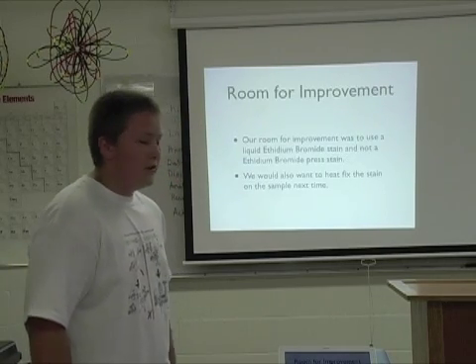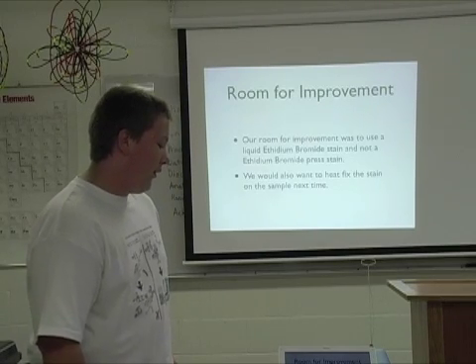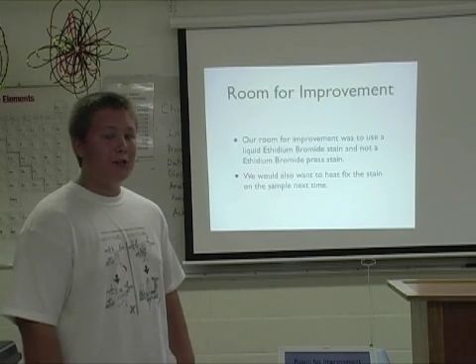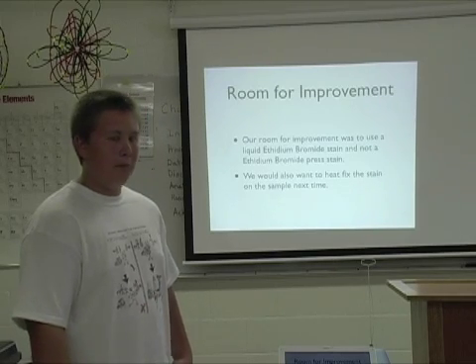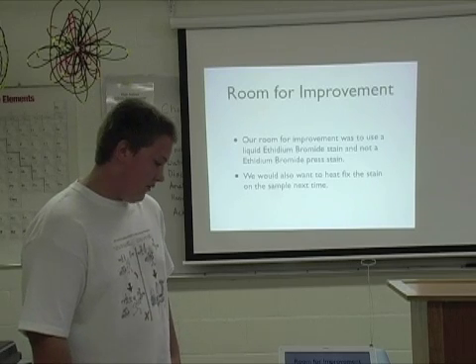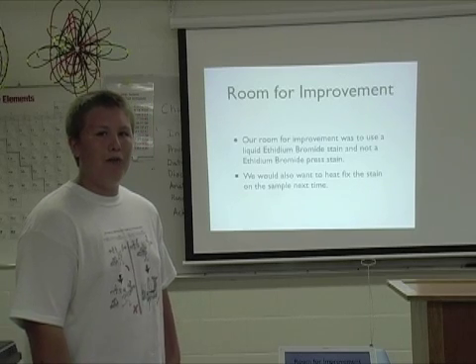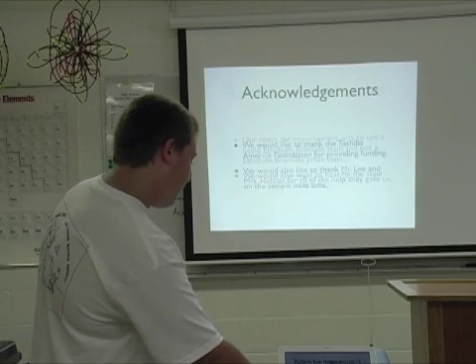Our room for improvement was to use a liquid ethidium bromide stain, kind of dangerous, but that's the best one to use, because we used an ethidium bromide stain patch, and that didn't stain it enough, so we couldn't take a picture of it then, and it would just work out better. And we would also want to heat fix the stain next time, so we could leave it overnight or move it without the stain possibly being contaminated.